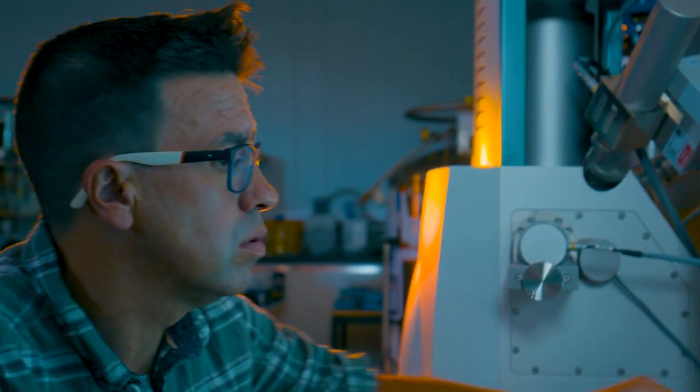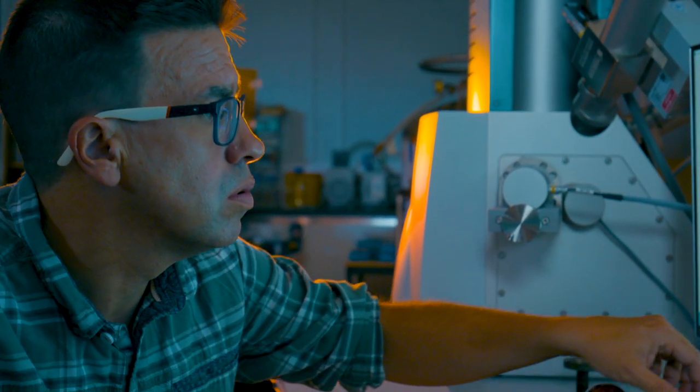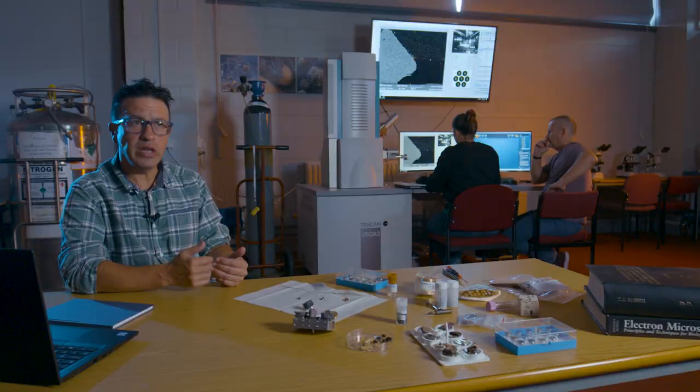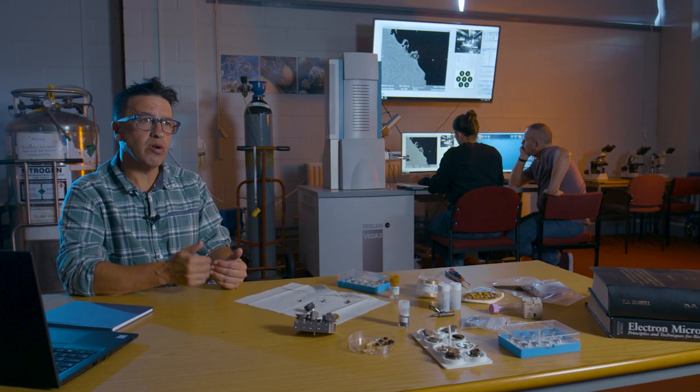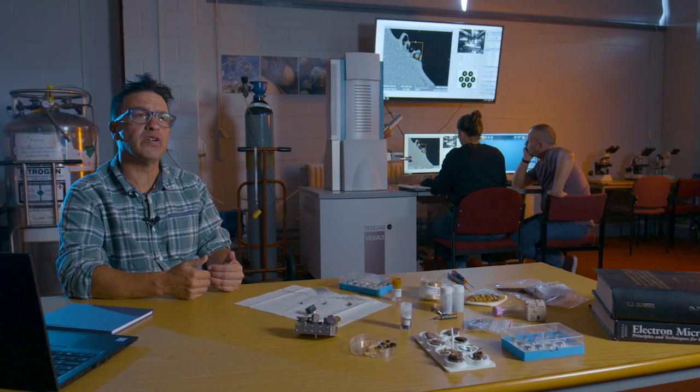Whether that's from a commercial point of view or whether it's from a research point of view or from a student point of view, each and every sample is different and what you find out leads to further questions and that is what science is.